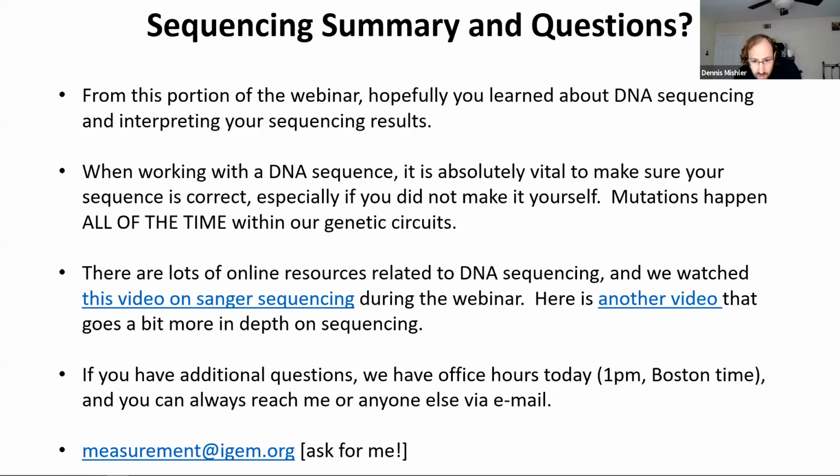Hassan, you've asked, do you always measure the concentration of DNA using a nanodrop? This gets down to how you measure the concentration of your DNA. Many people use nanodrop. I am not a huge fan of nanodrop. Nanodrop concentrations are regularly off by a factor of 2. But nanodrops are widespread and widely used, so if you have a nanodrop, it is better than nothing. Use the nanodrop, send those concentrations in.